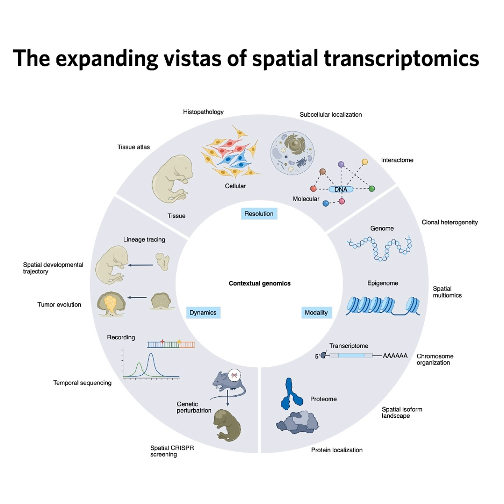One way is by randomly depositing millions of tiny pre-barcoded beads onto the surface, like with SlideSeq. Another way uses specialized DNA amplification processes, things like rolling circle amplification or RCA, to generate tiny, dense clusters of barcoded DNA. These are sometimes called nanoballs or polonies. Nanoballs? Wow. Yeah, they can be incredibly small, like 200 nanometers. Because they're often generated randomly, you then use imaging or other methods to figure out the precise location of each bead or nanoball computationally after the experiment.